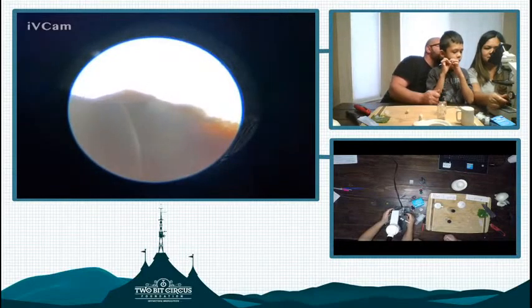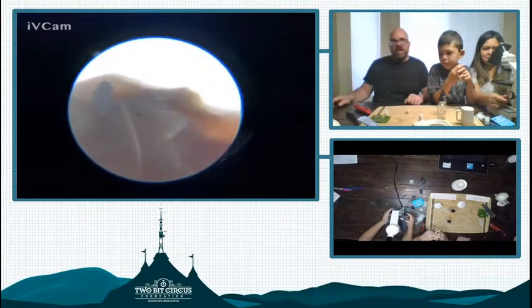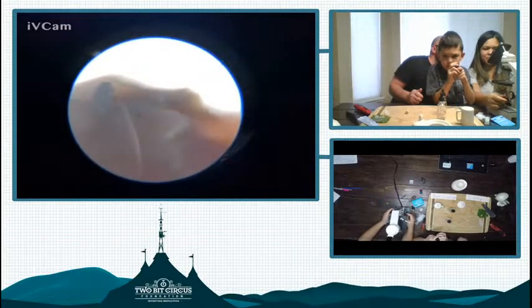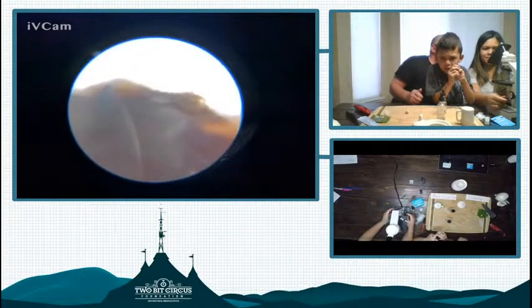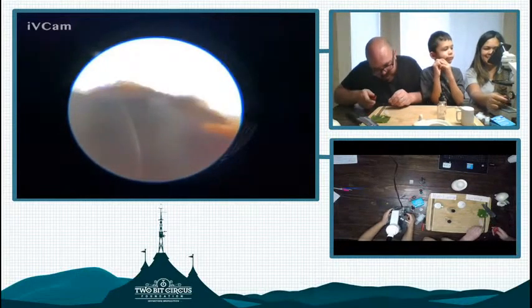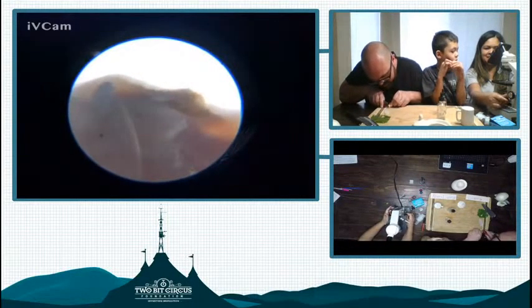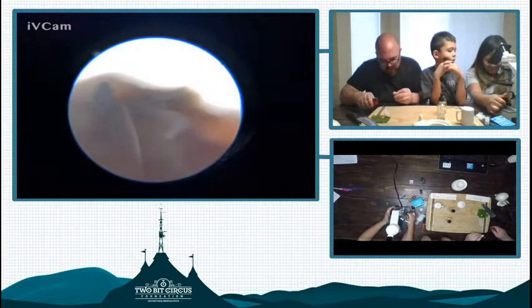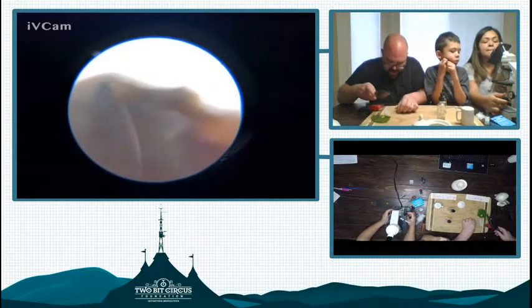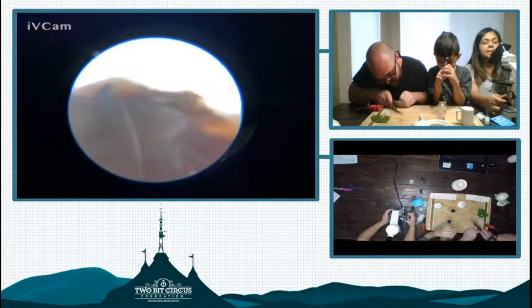So I was able to see, before the objective lens was moved, that I saw some shapes and patterns in that cork. I don't know if you saw that, Robert. Did you see that? Now I see more. We're almost seeing it. Here, you do this part. See, I'm messing with the fine one too. I just moved the big one. Of course, you'll be able to see it. I am trying to dissect this cork into a thinner piece right now. I don't know if I can do it.